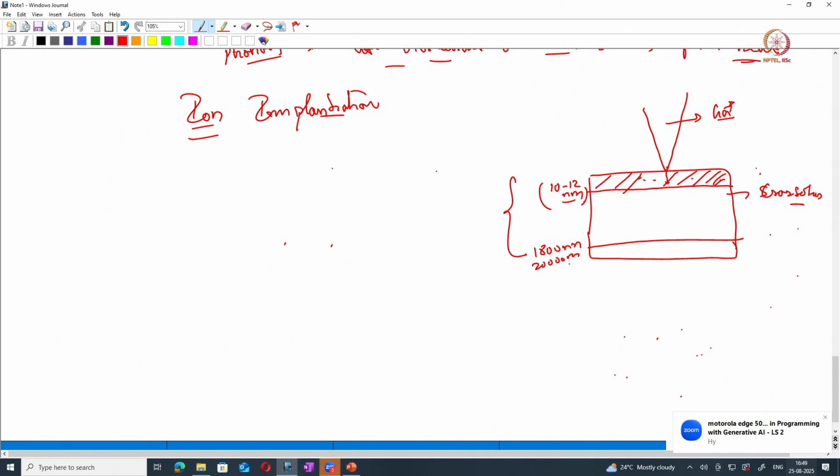The average depth at which the gallium goes into the sample and comes to rest is called the projection range, R projection.